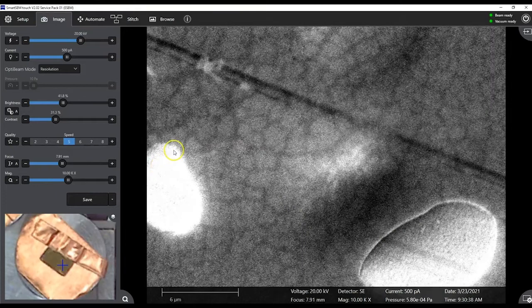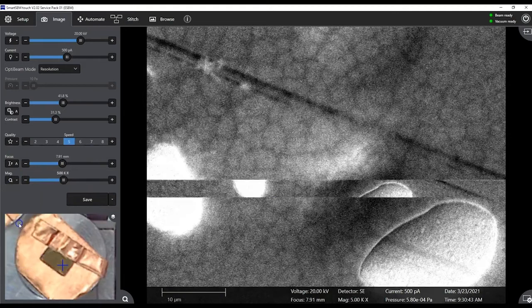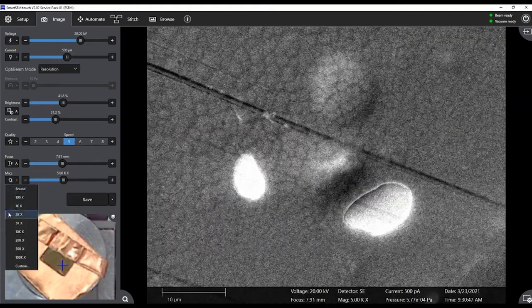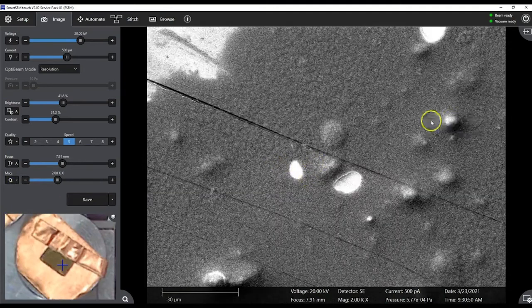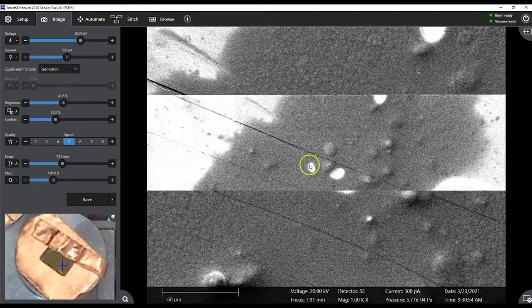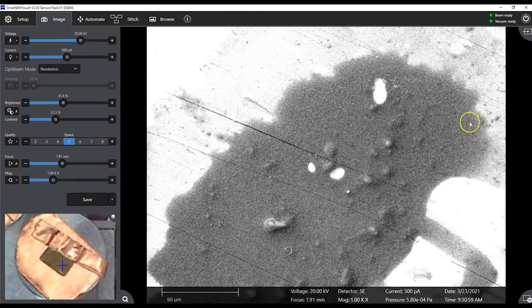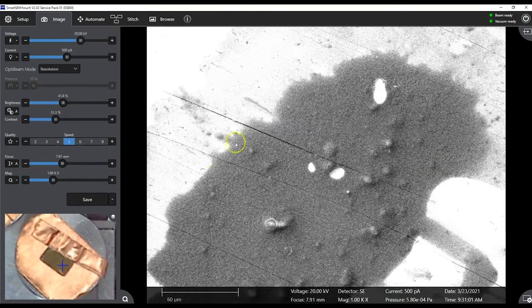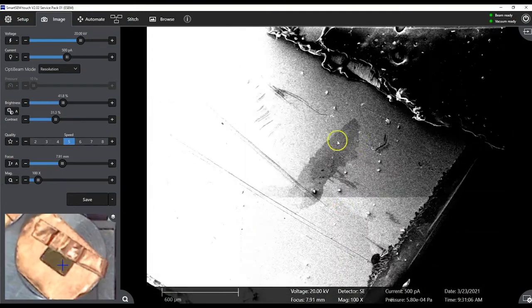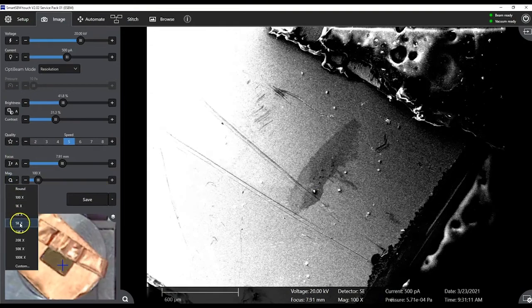Now we'll go back up to 5. See, nice focus. We go back out to 2. Again, great focus. Things are looking good. 1K, and you're getting a better sense of the whole region here. This all looks like it could be a really good spot, potentially. 100, there's that whole region there. Now we're going to go back up to 5 again.